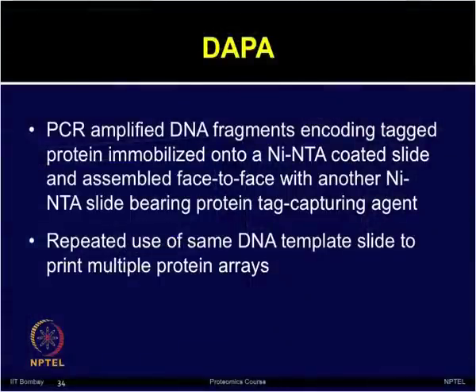In DNA arrays to protein arrays, the PCR amplified DNA fragments which encode tagged proteins are immobilized onto a nickel NTA coated slide and assembled face to face with another slide, also nickel NTA, bearing a protein tag capturing agent. The repeated use of the same DNA template can be performed here, and multiple protein arrays can be generated by using the DAPA method.